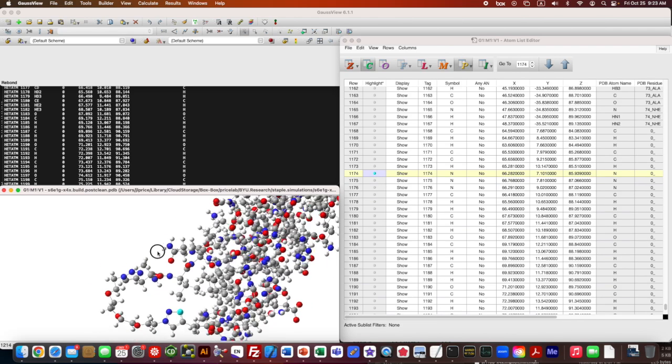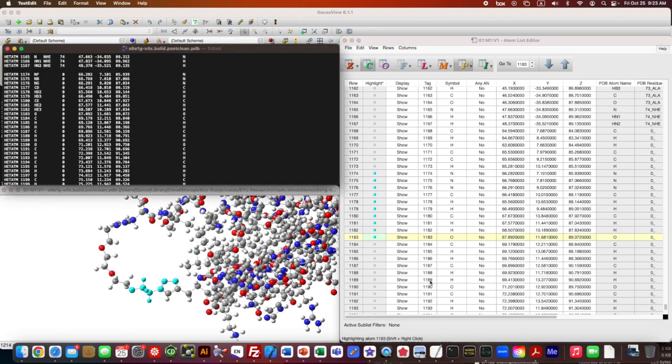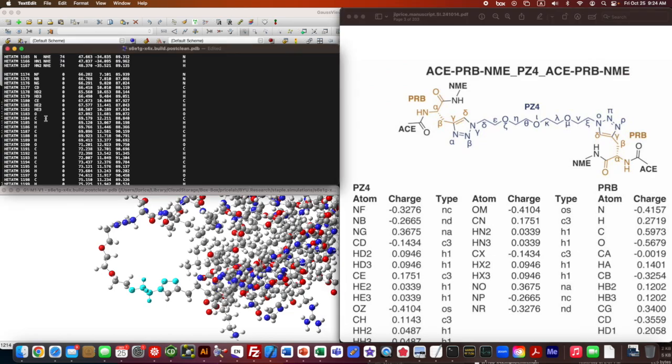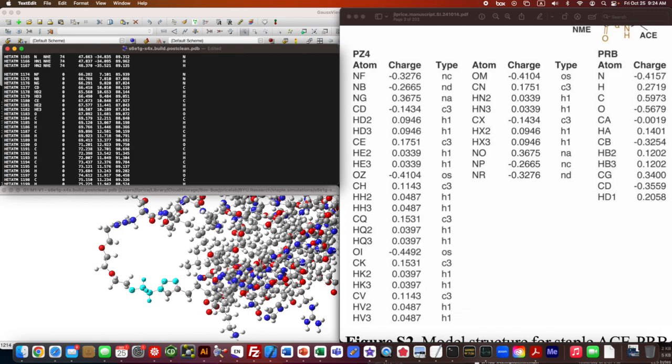Oh, what's with this strange atom geometry? It's doing the exclusive highlighting. Clicking on stuff and just seeing that it's in order. Do you check that every time? No, because I know that they're in order in the file that I pasted them in, so you can probably just count on them being the right order. So I just got to keep plugging away with the atom names.